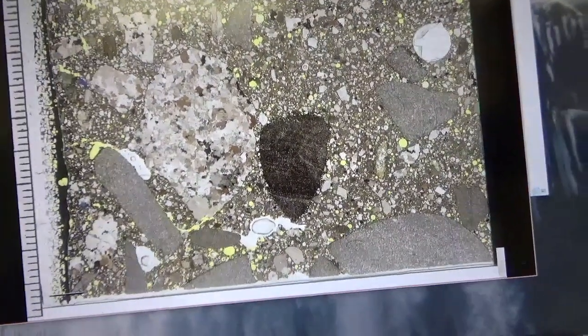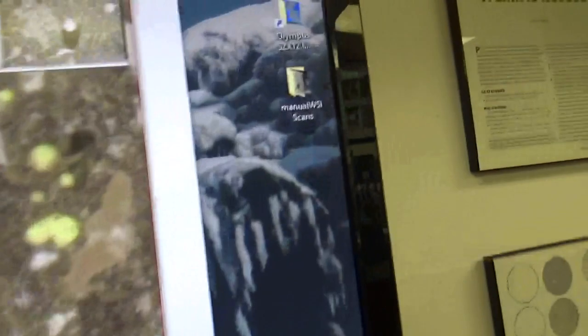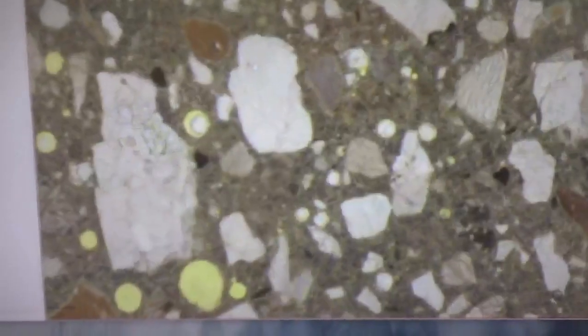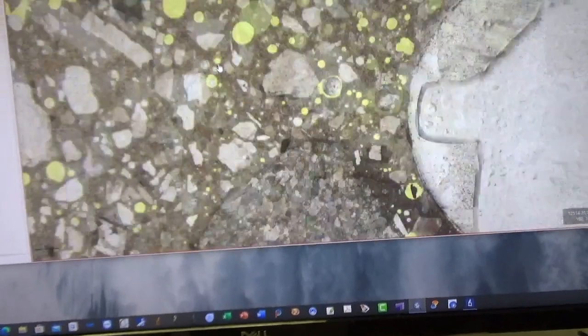Now QuPath is nice. It shows you the entire image in the top right corner, and then you play with your mouse wheel to magnify. You can really magnify. You can see how small an area I'm looking at here, just a tiny little area in the slide, and you still have nice resolution. So it really gives you a high resolution whole slide image.